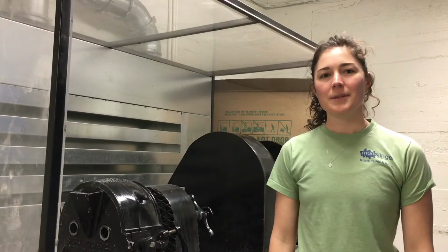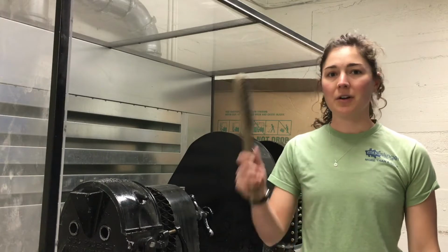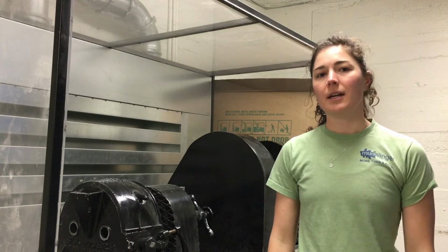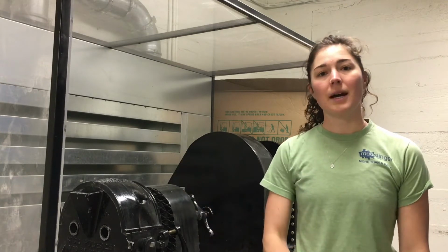My first step in this process is to clean this entire room with a vacuum cleaner, a wire brush, and an air compressor. The reason for this is because I don't want any grains to contaminate my samples.